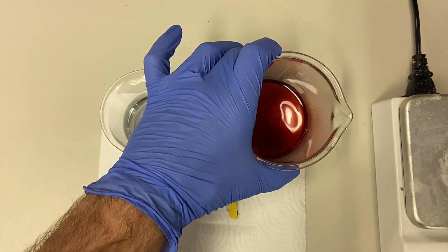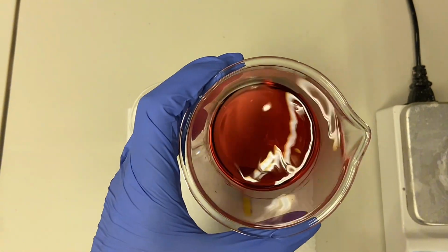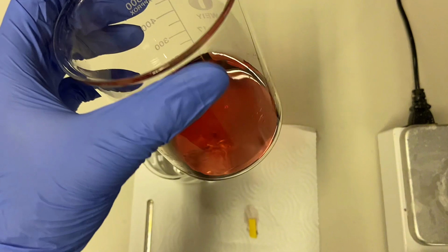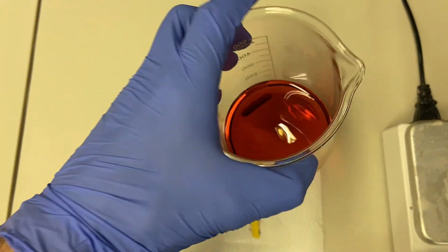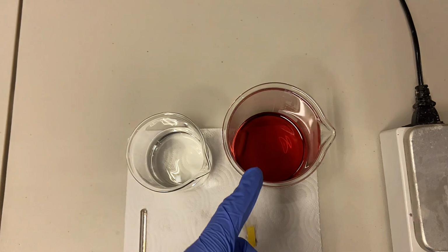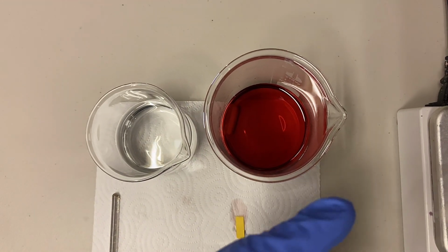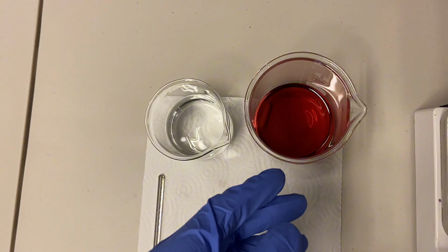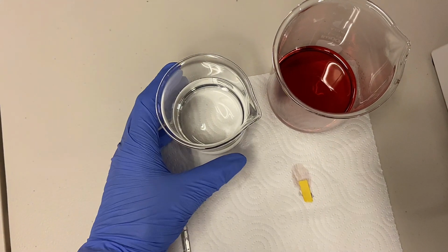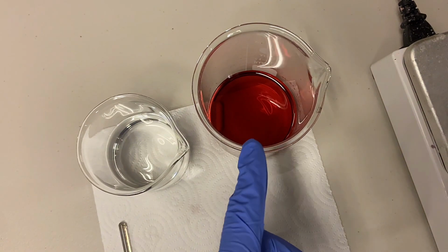Everything's been filtered now. We've got a nice clear red liquid here with no stray graphite or black mass particles floating around in it, which is exactly what we are going to need for a manganese extraction and all the future extractions. Interestingly, it's very red, which means that there's a lot of cobalt in there. You'd think that a vape battery would have more nickel in it, which would give it a green color, but I suppose not.